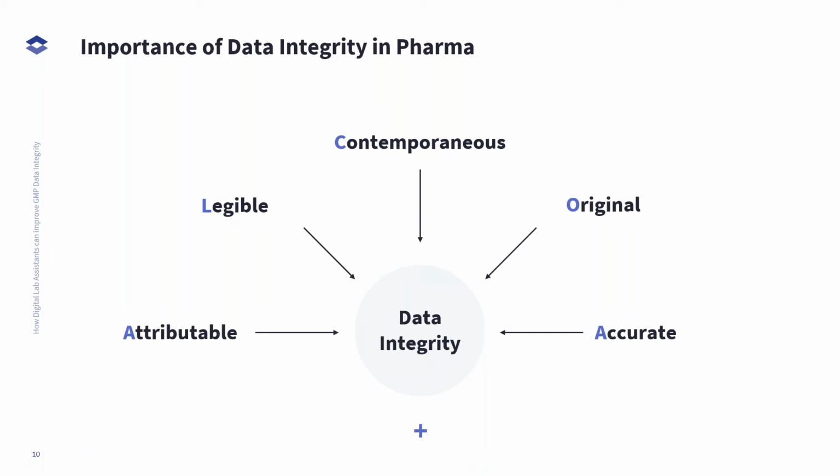So I really liked Stefan's articulation of a data record, right? You really have to look at a data record all the way from its creation through all of the different steps into destruction, and all of the different attributes that we need to consider for that data record. One of the other extensions, though, that I think is really important, and how my team and I look at this, is that it's not just the individual record itself.